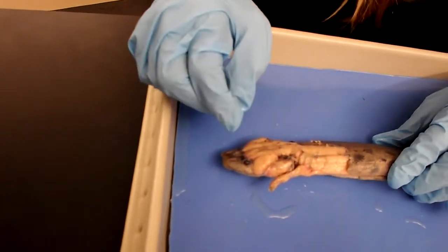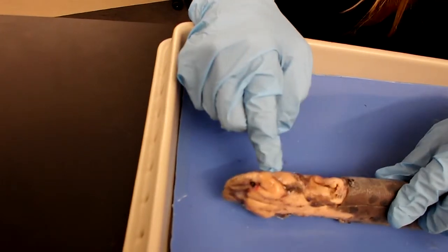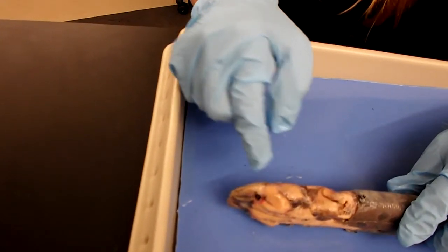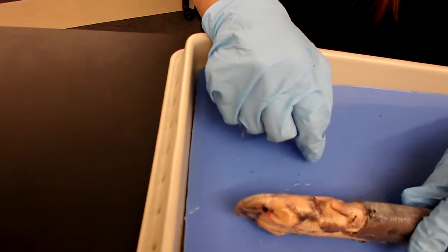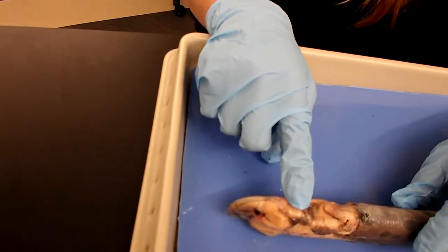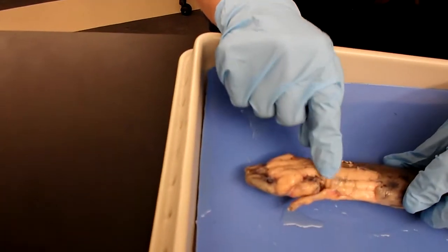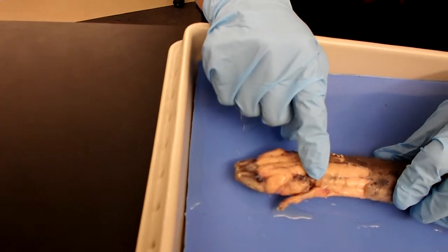preorbitals of the shark. The depressor mandibulae right here is homologous to the levator hyoideus of the shark, and the branchiohyoidus right here is homologous to the superficial constrictors of the shark. And then the levatores arcuum, which are right here, are homologous to the cucullaris of the shark.